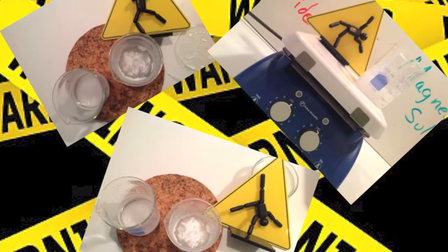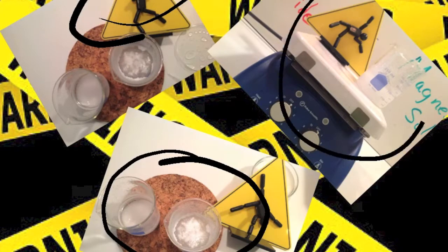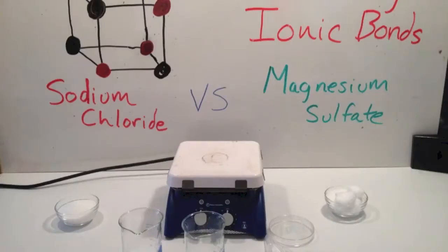I can't begin to tell you how important safety is for this lab. You have to wear your goggles. You have to be aware of what's going on, and things are going to be hot, and definitely no horseplay. So when you're doing all this, we want you to have fun, but be safe, and see what you can discover about the crystal shapes and crystal structures of sodium chloride and magnesium sulfate. Both of these ionic compounds are common in our everyday lives, and they're very useful things. But in the conditions that we're working with, there are some safety issues, so be aware of that.